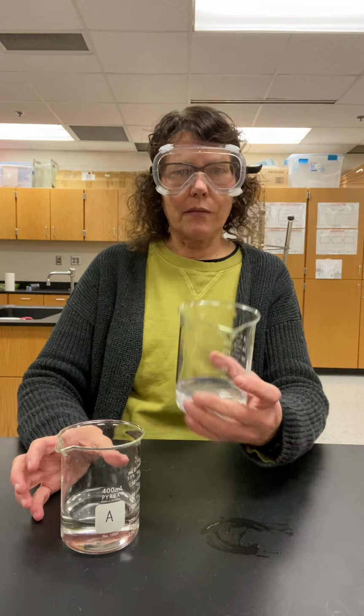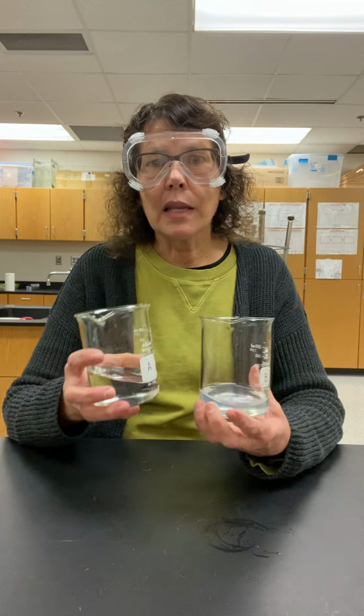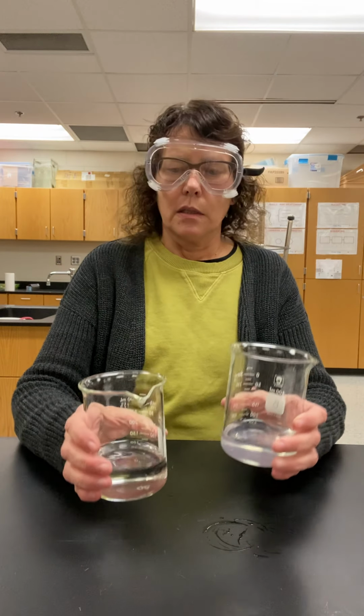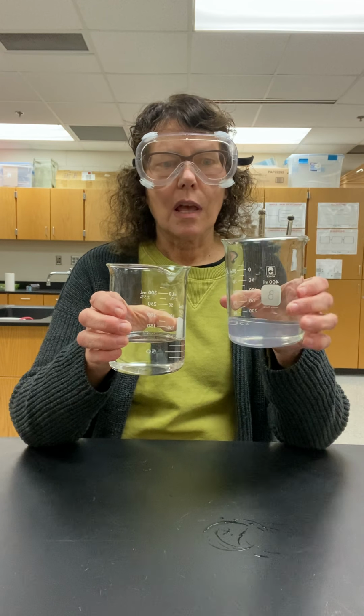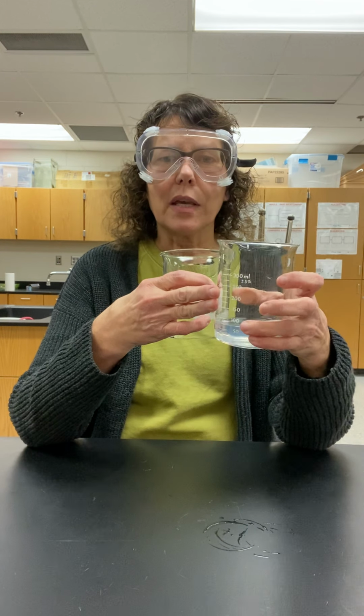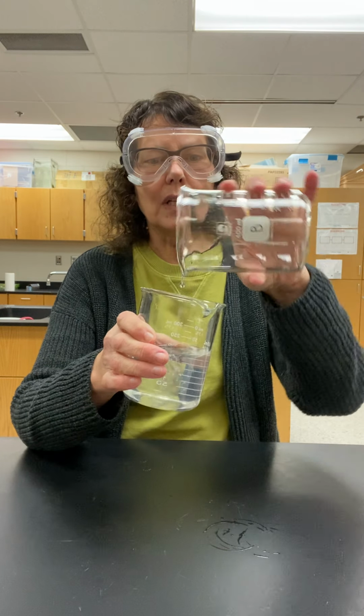So I got one that I've labeled B and one that I've labeled A because it's gonna be combining them that causes something to happen. All right, so watch carefully and do not take your eyes off of these solutions. I'm gonna even talk while I do it because I've had some students tell me they think this is fake. It's totally not fake.